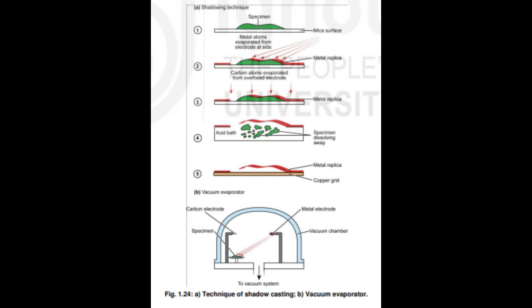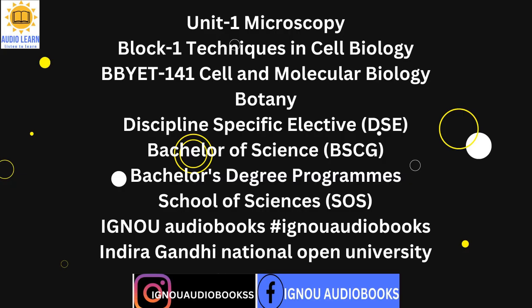The invention of the transmission electron microscope improved our understanding of cell biology, but the sample to be viewed required preparation before use. Various advancements such as transmission electron microscope (TEM) and scanning electron microscope (SEM) proved very useful as they showed remarkable ability to study surface topography and 3D structure, along with improved resolution, 30 to 100 A.